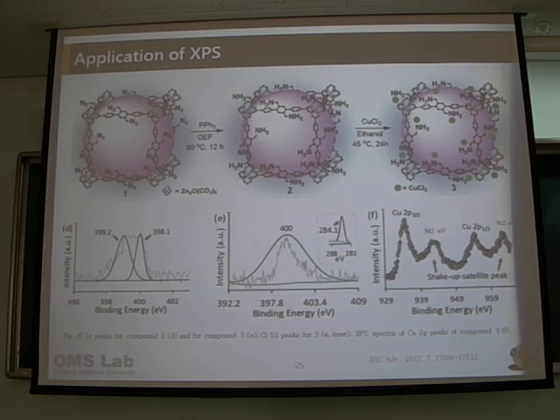So for this copper, there is still a vacant site, and through this vacant site, the nitrogen of your morph will be coordinated, right? So this coordination will not affect the oxidation state of your copper.